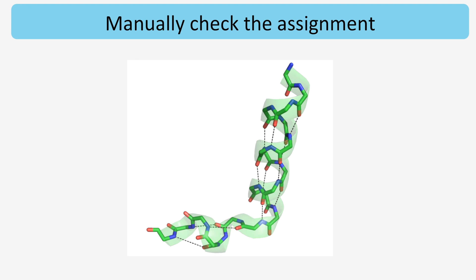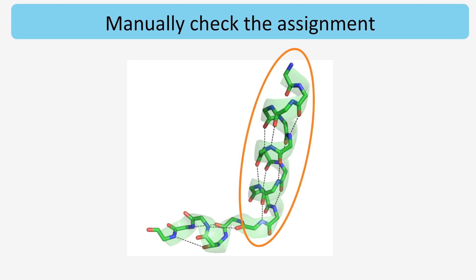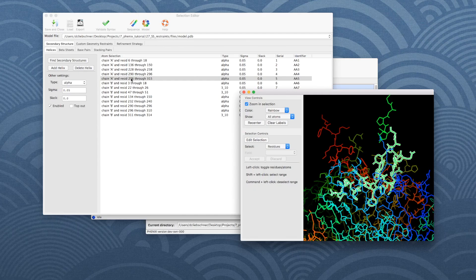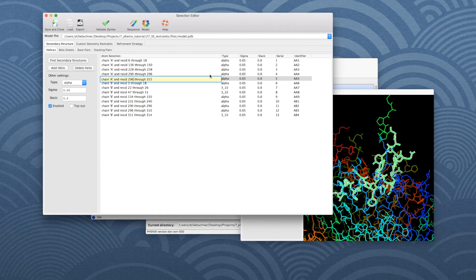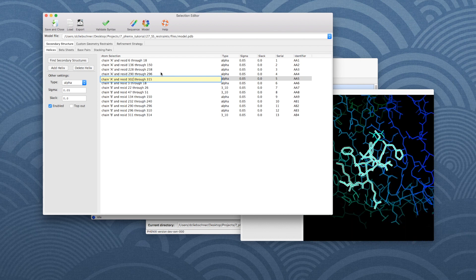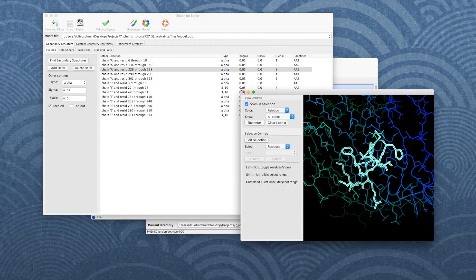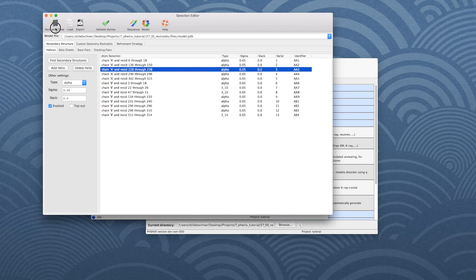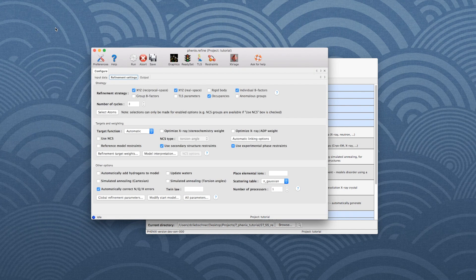If you have corrections, you can input them into the Selection Editor. Let's say we only consider the fragment on the right as alpha helix — it runs from residue 302 to 315. In the editor, click on the helix and change the residue range accordingly. Once you think the annotation is correct, hit Save and Close. If you don't have other options to change, you can start the refinement.